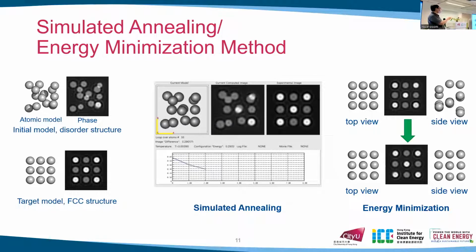Then we will compare the calculated image and the experimental image. The difference between the two images will go down, which means our structure approaches the experimental images.